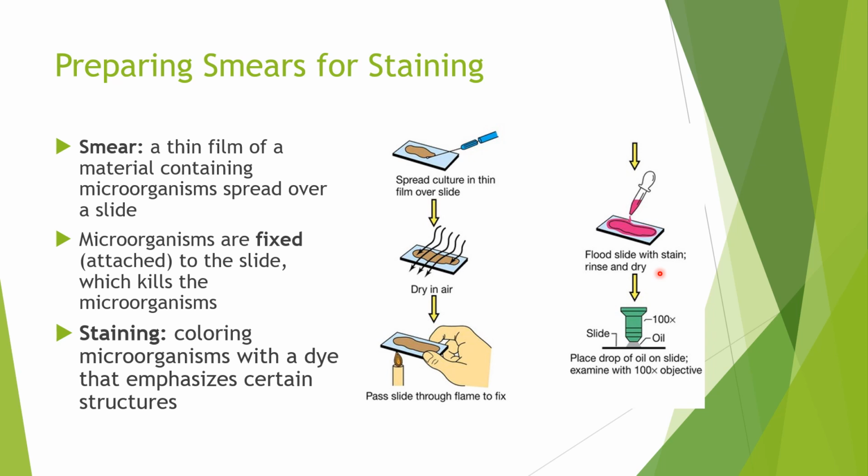You don't want to dry it too harshly, because if you do, you're just going to take off your bacteria that you just spent so much time prepping. So you have to be very gentle when you're blotting your slide dry. And then the last step, of course, is to view it under the microscope. And as I said, with microbiology, we usually have to go all the way to 100x to be able to see those bacteria cells.